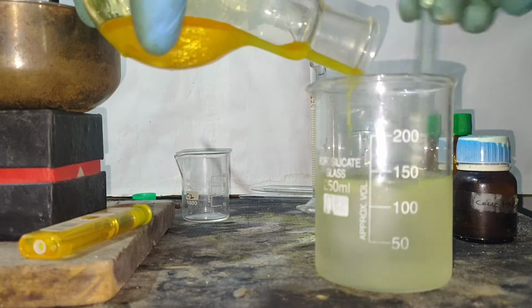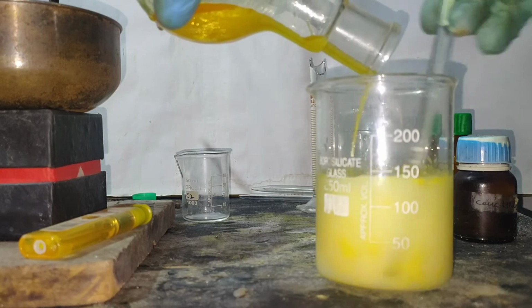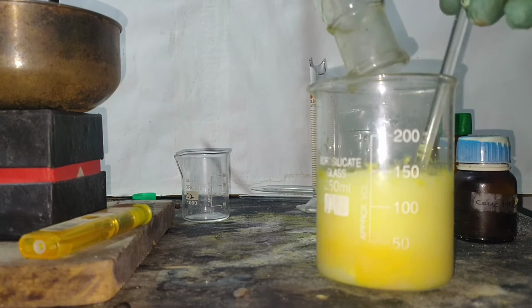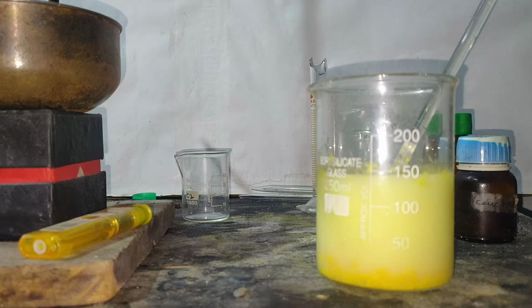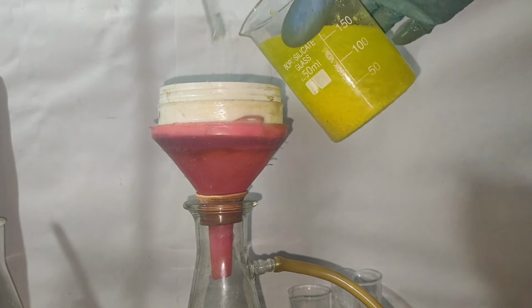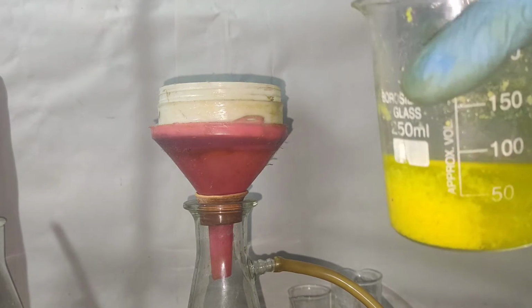Then I poured the reaction mixture into 100 ml of ice cold water with stirring, where alpha-nitronaphthalene separates out as a yellow solid. It was kept for some time for the aqueous layer to clear up and then filtered off via vacuum filtration. It was washed with distilled water a couple of times to remove any adherent acids.